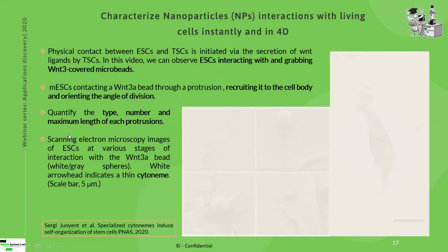So let me give you the first example of this application, checking some interaction between living cells and microparticles. In this case, we have an embryonic stem cell that is interacting with and grabbing a microbead that is covered by a WNT3 stimulus.